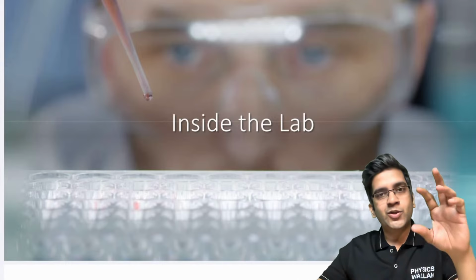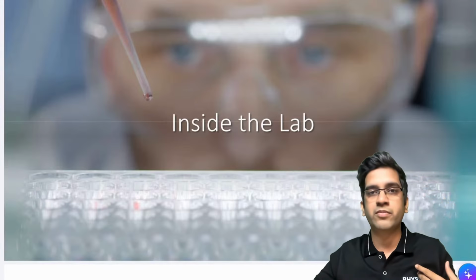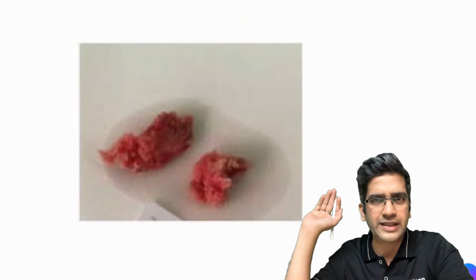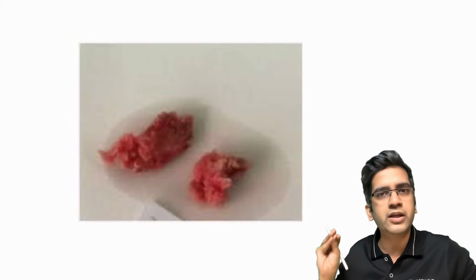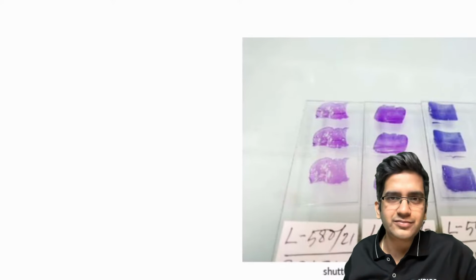So now the goal is simple. You take a biopsy. Could be a biopsy from the breast, from the intestine, or from the brain, right? Biopsy will be like a chunk of tissue like this, right? You must have seen biopsies being taken. If not, when you go to surgical procedures, you will see them, right? It'll be a chunk of tissue. They'll take a piece from any part of the body which is pathological, to see what the problem is. This tissue has to get converted to this, right?